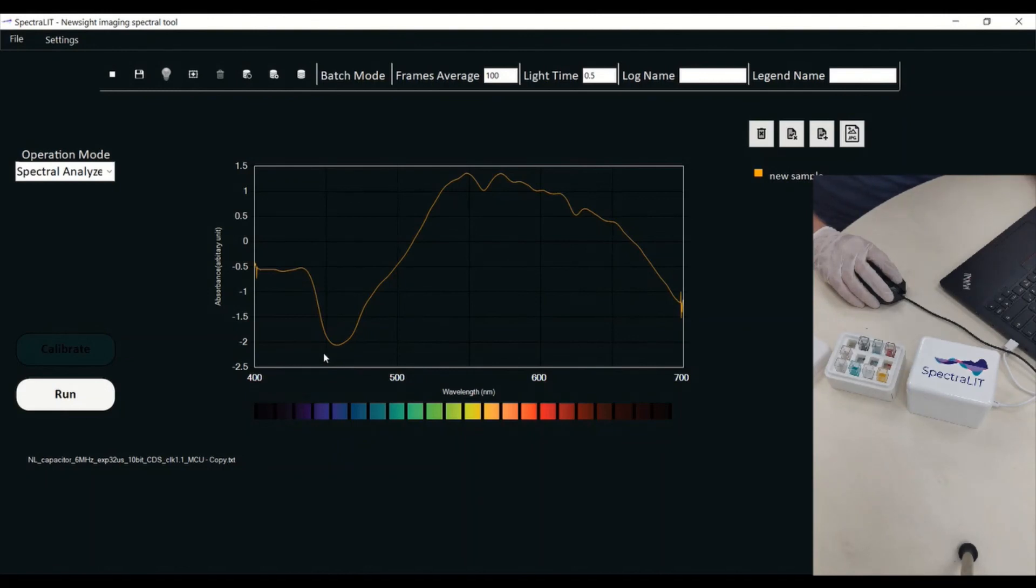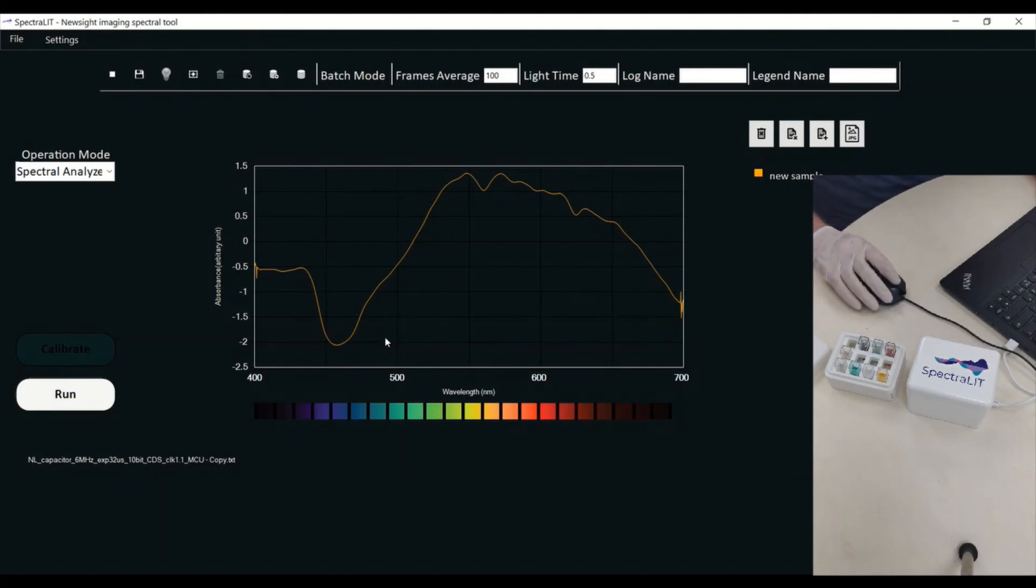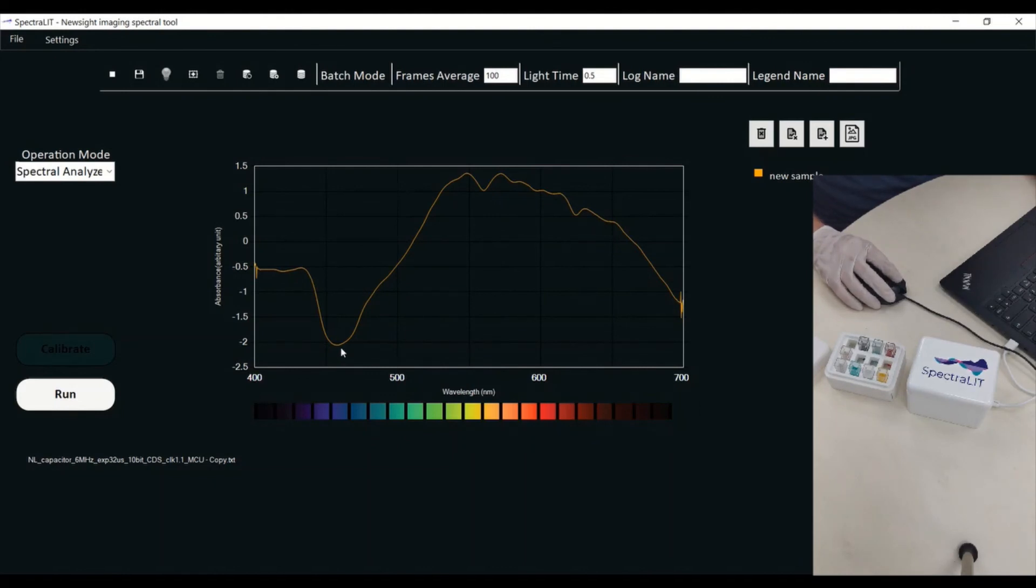As explained before, the Spectralit is a device that gives you absorbance values. So the less absorbance I have in a specific color, that is actually the color that I'm seeing with my eyes.